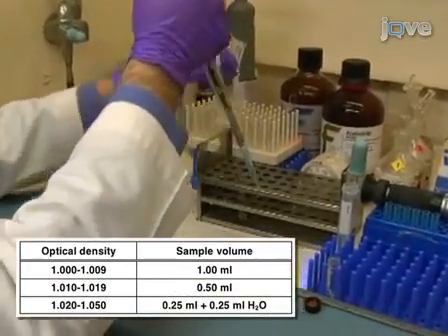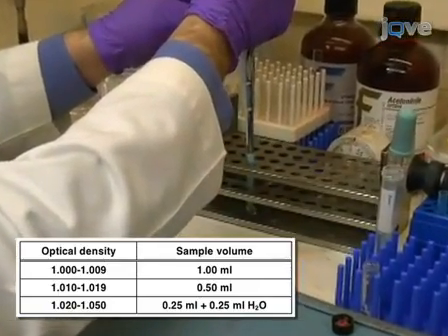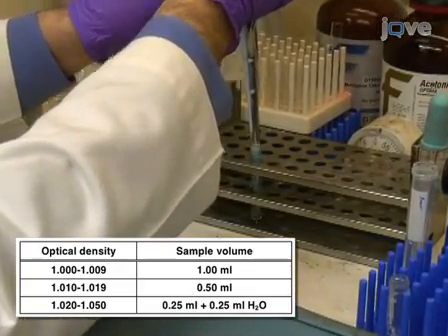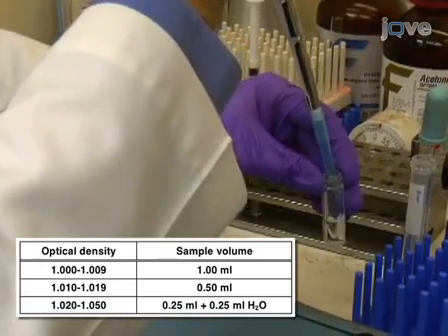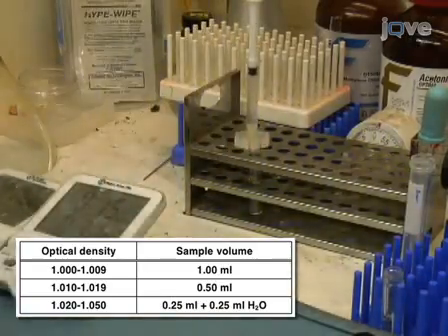For values between 1 and 1.009, use 1 milliliter of sample. For values between 1.01 and 1.019, use 0.5 milliliters of sample. And for values between 1.02 and 1.05, combine 0.25 milliliters of sample with 0.25 milliliters of water.